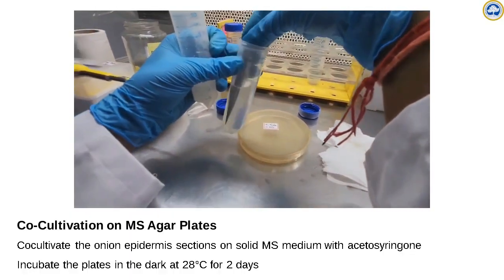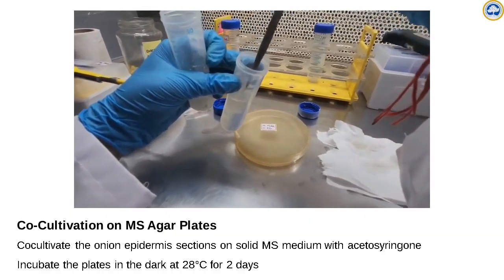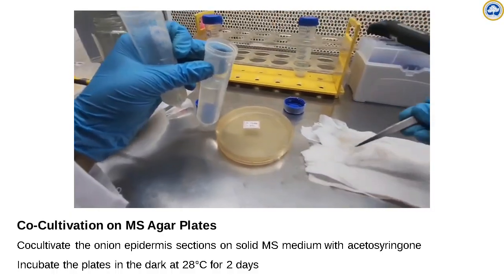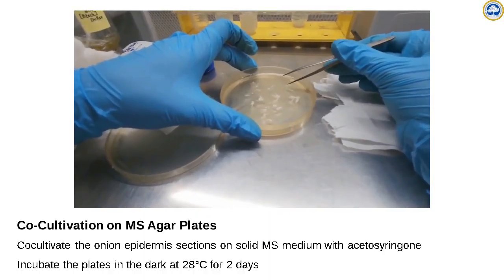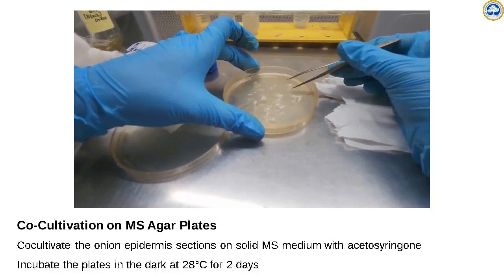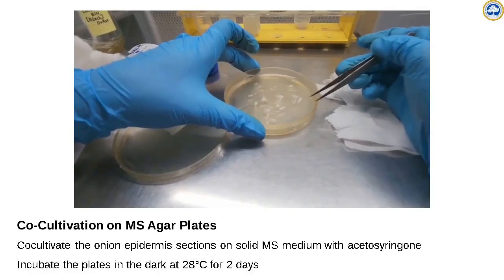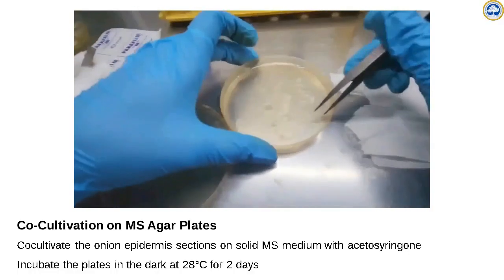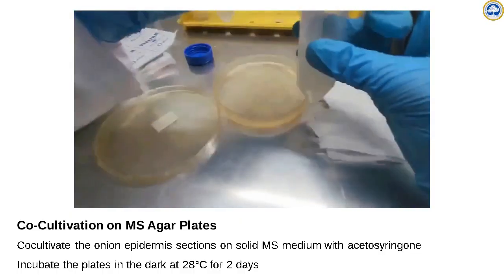What we do, we pull out the onion epidermal cells, we rinse the onion epidermal cells that were infected using agrobacterium, and place them on sterile tissue to remove excess moisture, and then we place them on the MS plates. This we incubate from 24 hours to 48 hours in dark at 28 degrees Celsius.